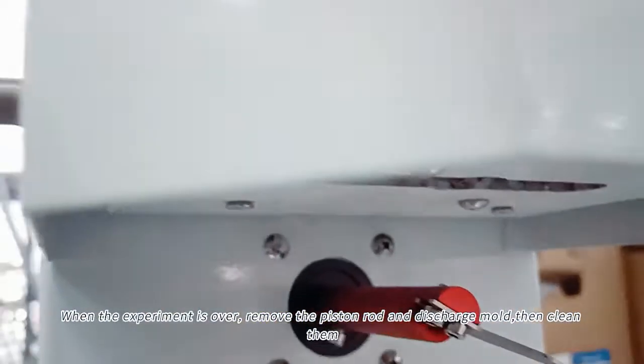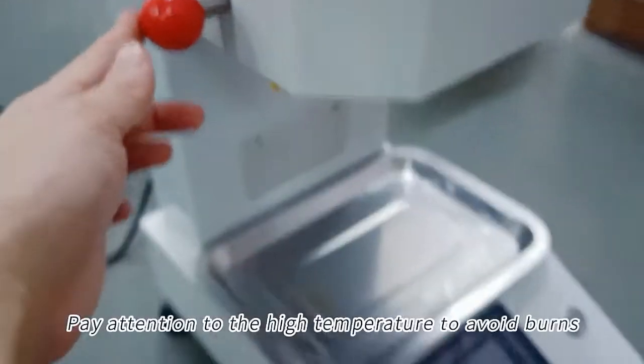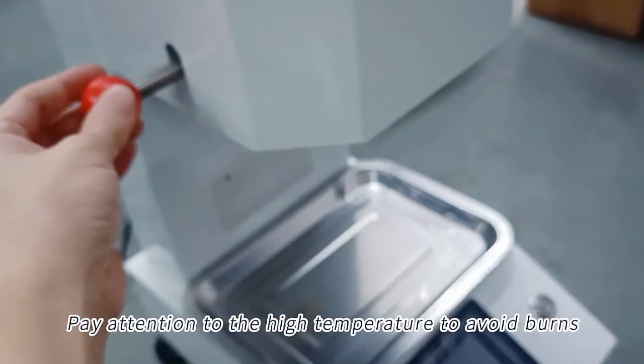When the experiment is over, remove the piston rod and discharge mold, then clean them. Pay attention to the high temperature to avoid burns.